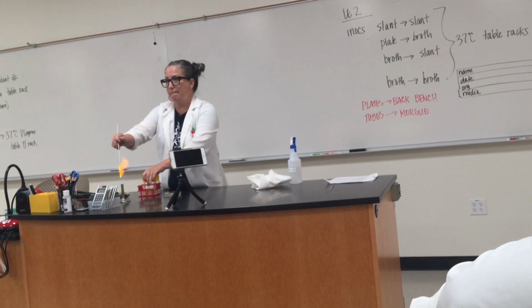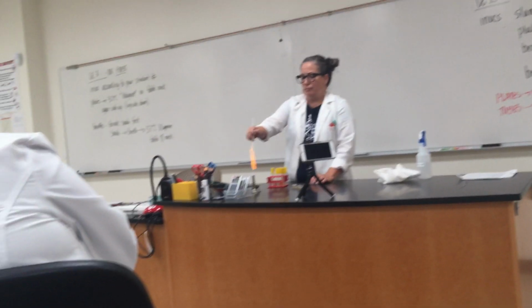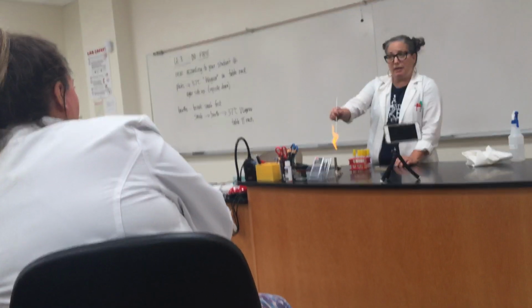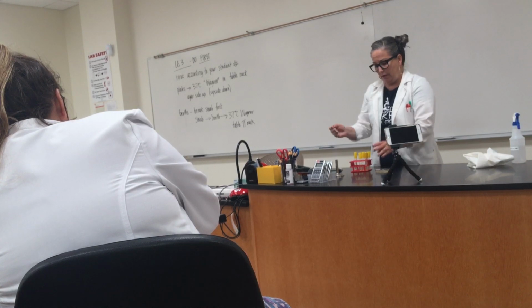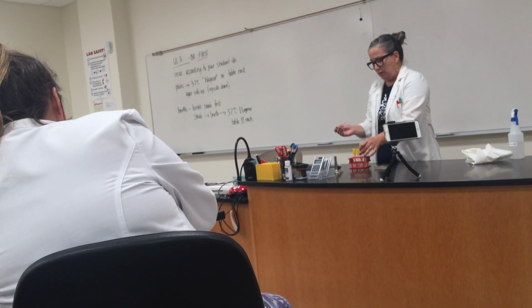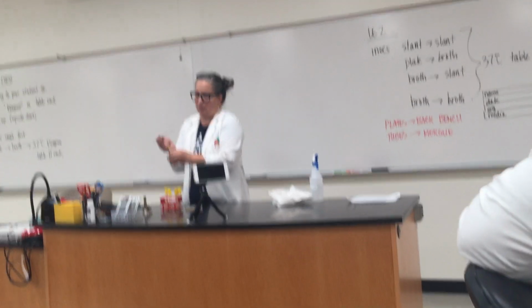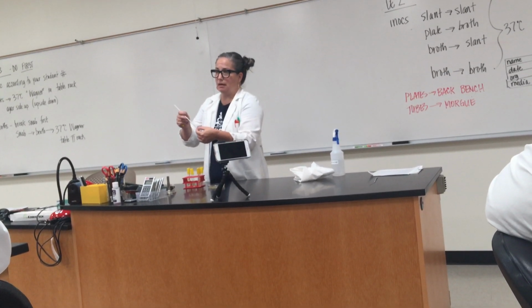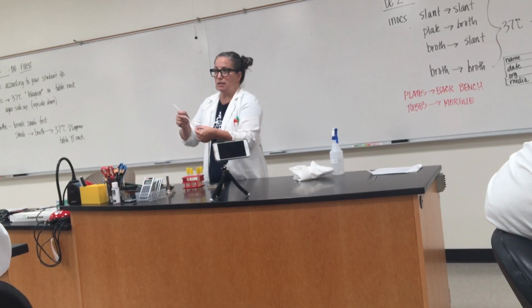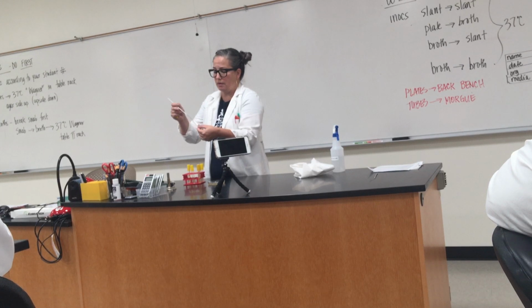After you sterilize it, how long do you leave it to know that it's cool? It cools pretty quickly. One thing that you can do, whether you're going into a slant or a broth or a plate, is take, so this is my organism and this is my hot sterile loop, I can do this and leave it for a one-potato count. And now I know it's cool. So when it went in, it was hot, but the cool liquid will cool it. So you can do that with broth.